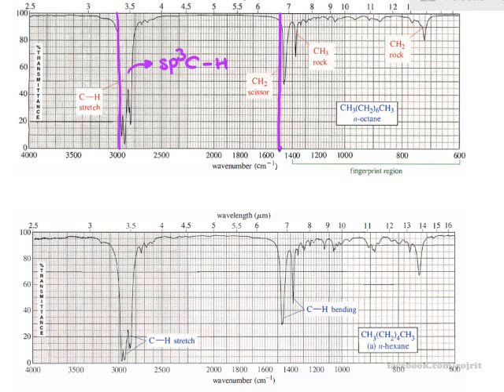In organic compounds we normally have R groups, and the R group contains C-C bonds and C-H bonds, which can have rocking, bending, everything, and they normally appear beneath 1500. Every organic molecule contains this kind of thing, with a very complicated fingerprint, so we normally ignore them.